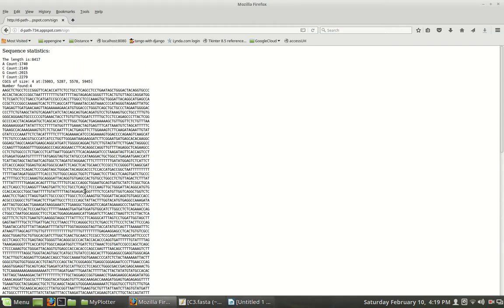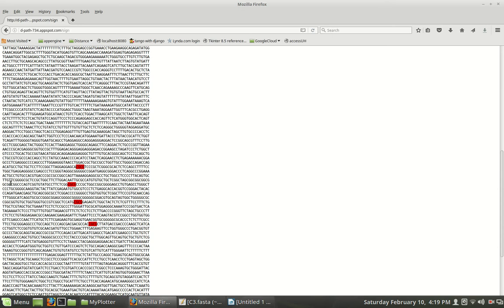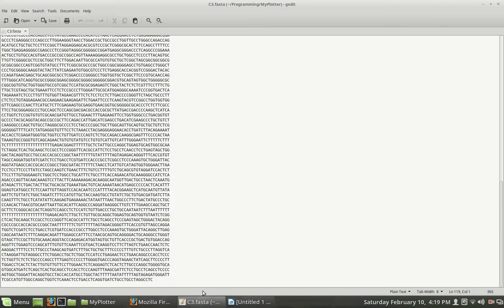This definitely tells you that this region in here is probably the beginning of your gene. Alright, as you can see, you do not find CG followed by CG anywhere else. This is telling you, hey, there's probably a gene right here, and indeed there is. Alright, that's the beginning of it. So let's go back.